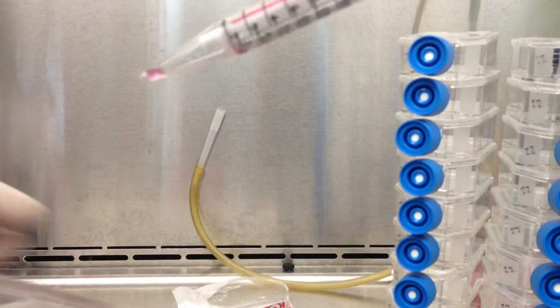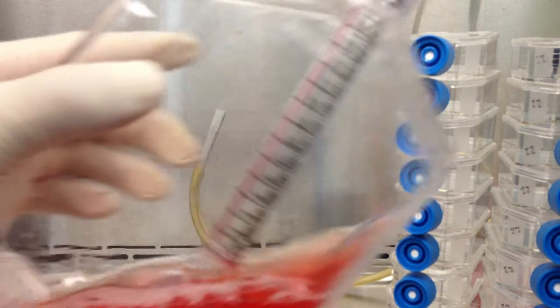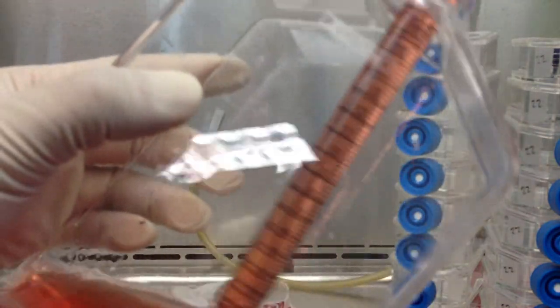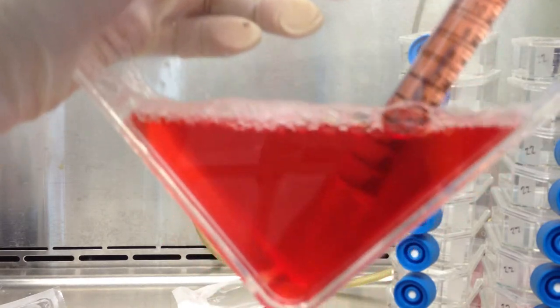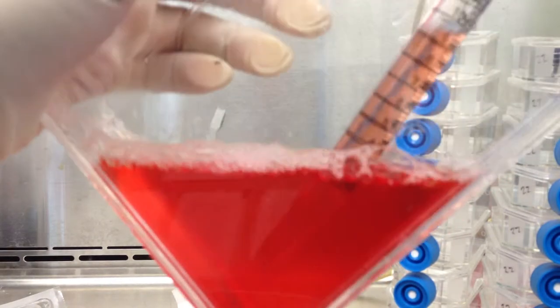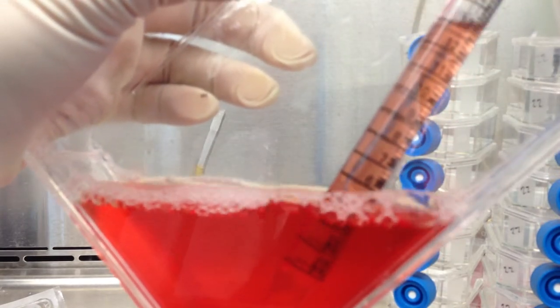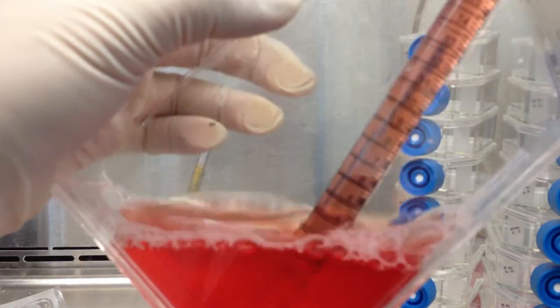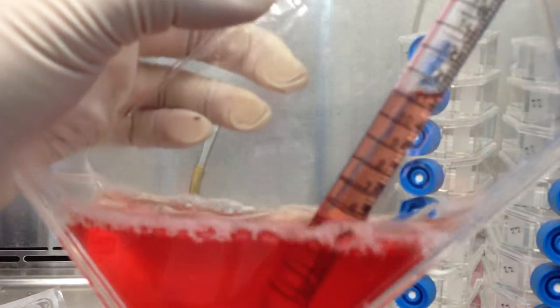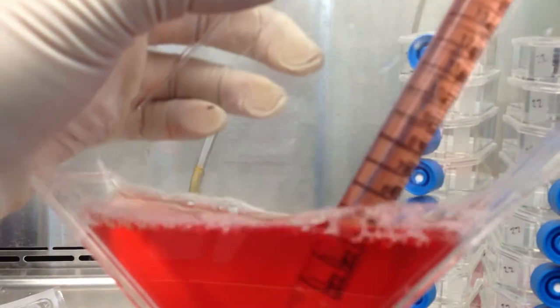Okay, so now what I'm going to do is take the pipette and put it in here and draw up and kind of circle around the bottom. I'm going to push it against the bottom of the flask while dispensing it. This is to get any large clumps of cells and break them up to get a more uniform suspension. You don't need to do this too many times, maybe like 4 or 5 times. Just swirl around, try to get up the big clumps and push against the bottom to break them up. Make sure not to draw any liquid into your pipetter as that will break it.